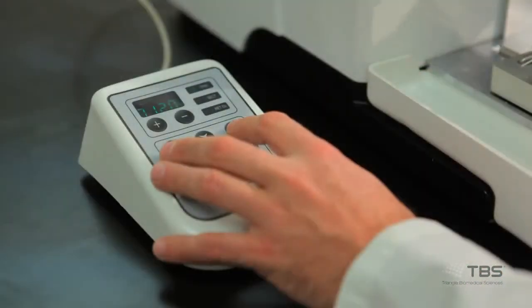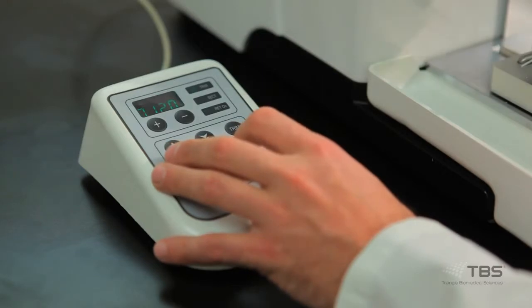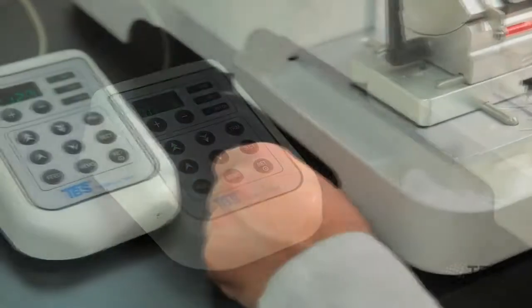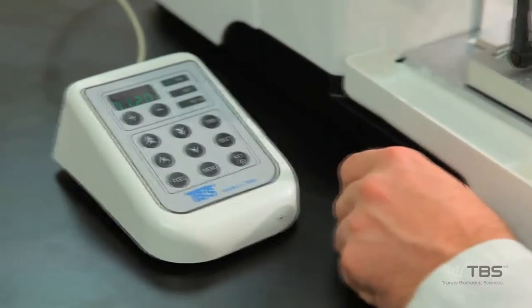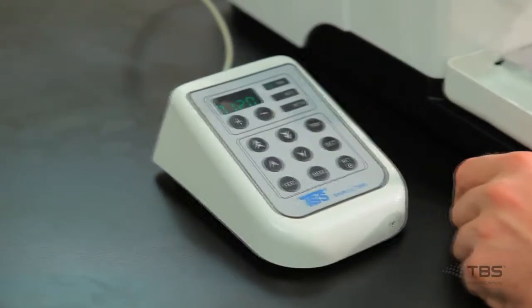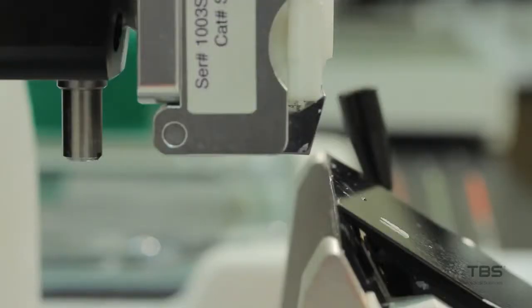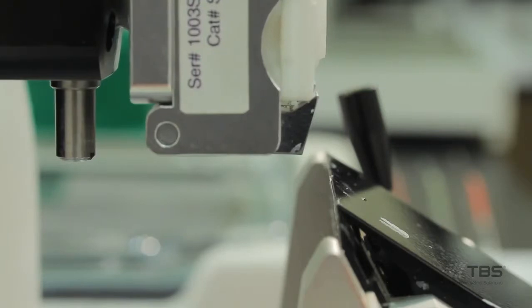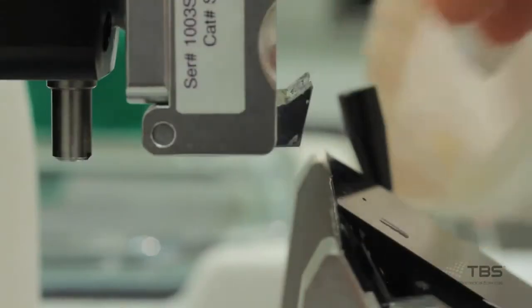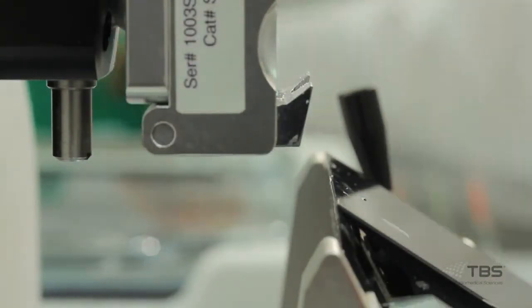The SC2500 model includes a user-friendly handpad controller that allows the operator to store separate trimming and sectioning thicknesses. An automatic specimen positioning memory function allows the tech to remove a block for rehydration or cooling.